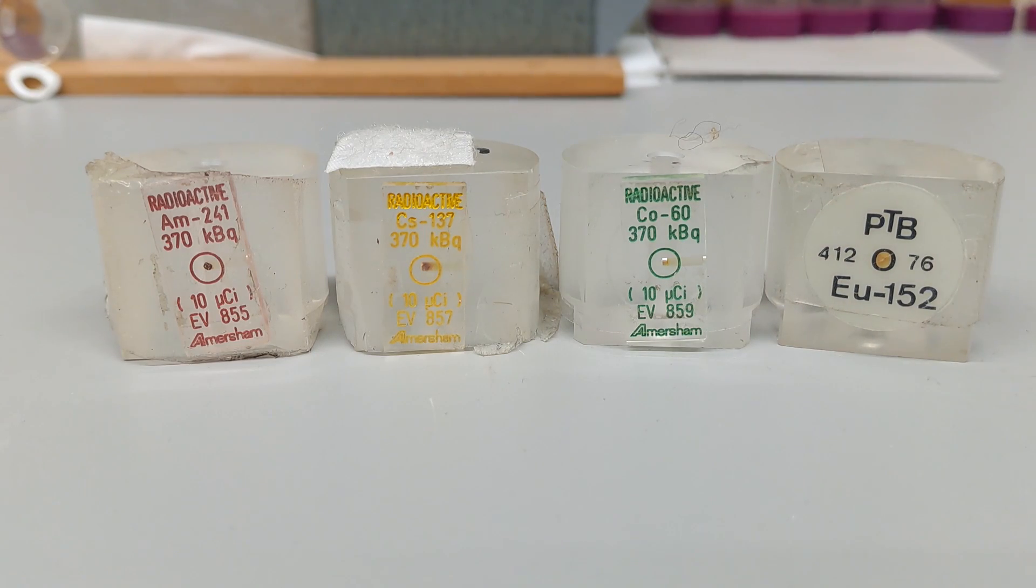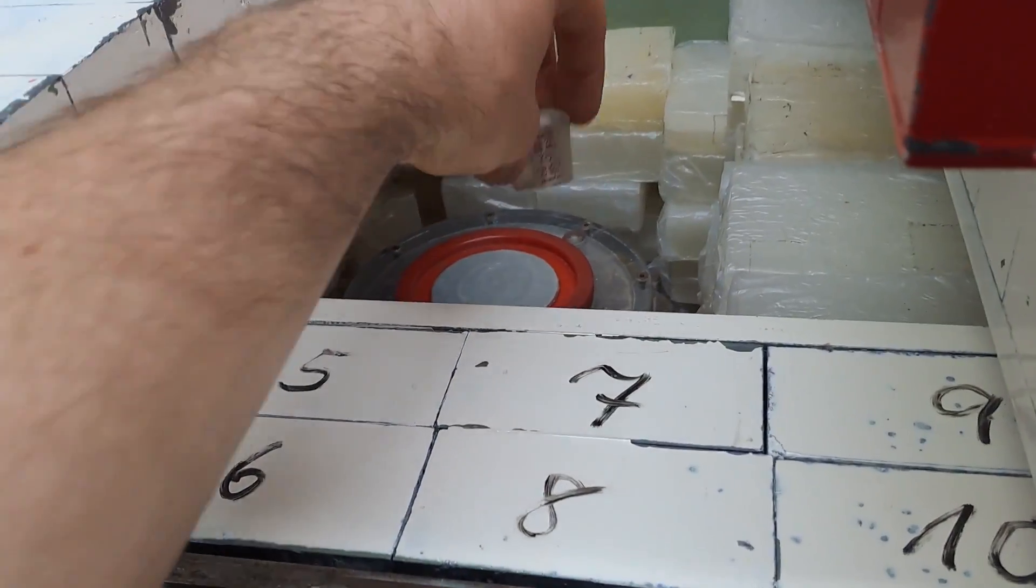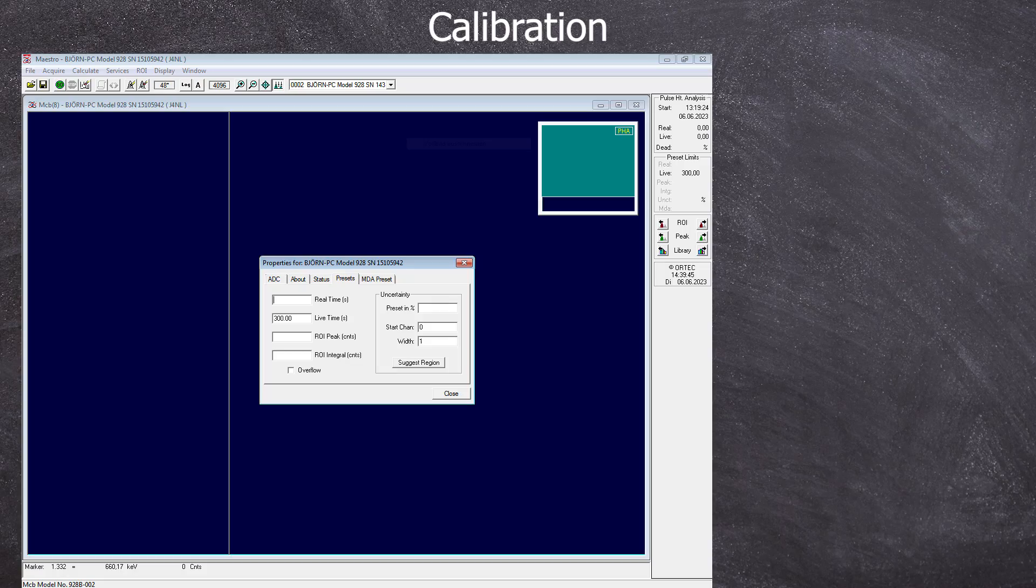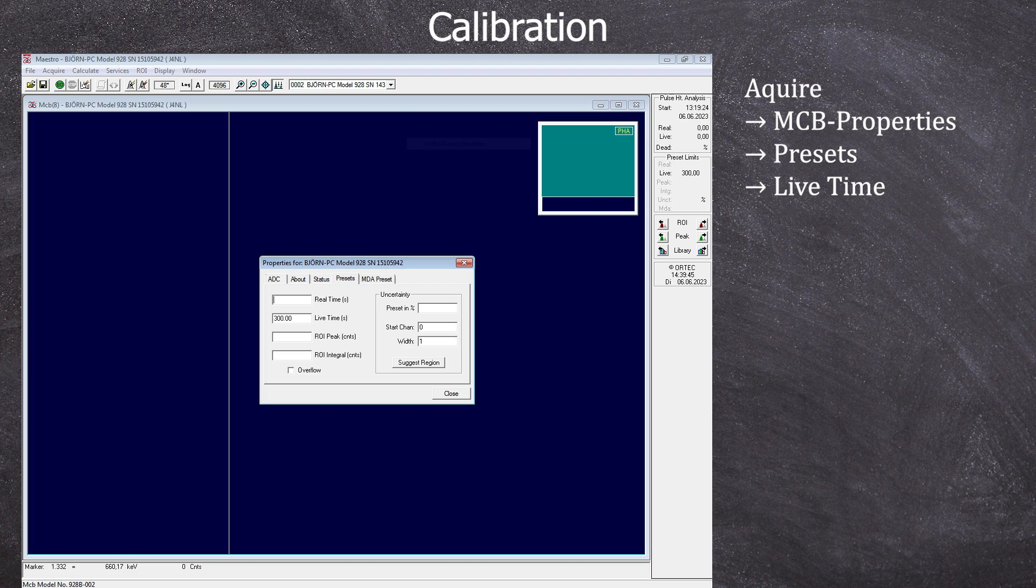Let's begin with Americium. To take a spectrum, you go to Acquire, then MCB properties, and then select Presets to enter a lifetime of 300 seconds, which is sufficient for a solid calibration in 5 minutes.